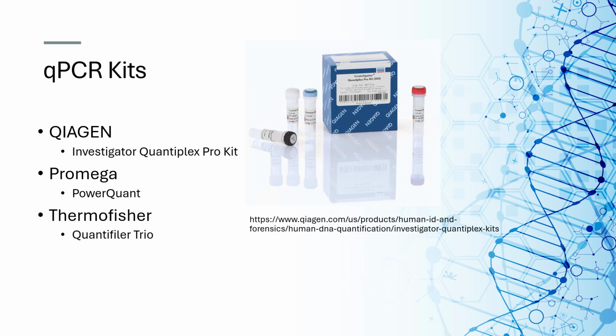Now, fortunately, we don't have to mix everything needed for the qPCR reactions ourselves. There are some companies that make kits that we can use that have been verified and tested so that we know they are reliable. The three main companies in the United States that manufacture these kits are QIAGEN, Promega, and Thermo Fisher. The kit featured in this picture is the QIAGEN Investigator Quantiplex Pro Kit, which is the one that we often use.